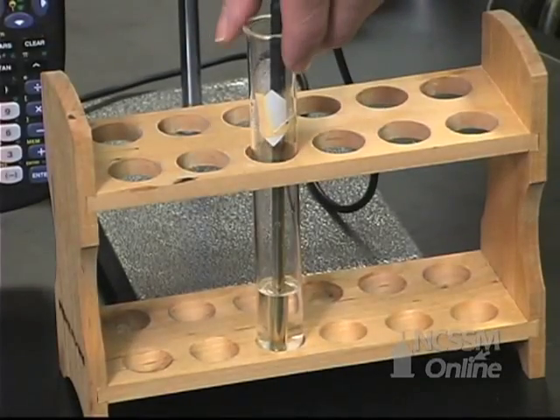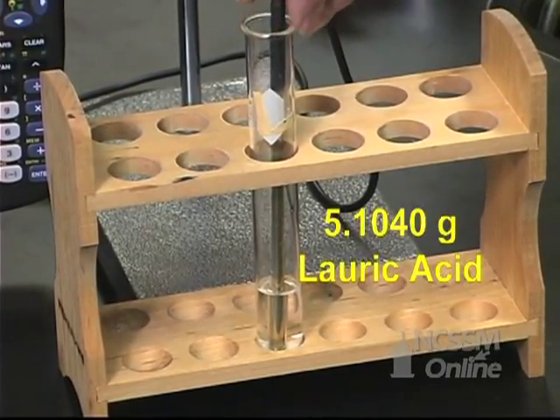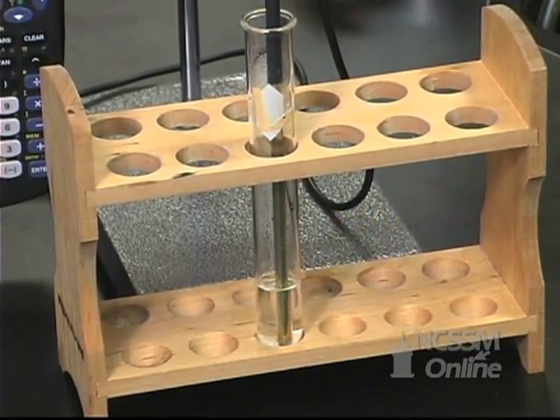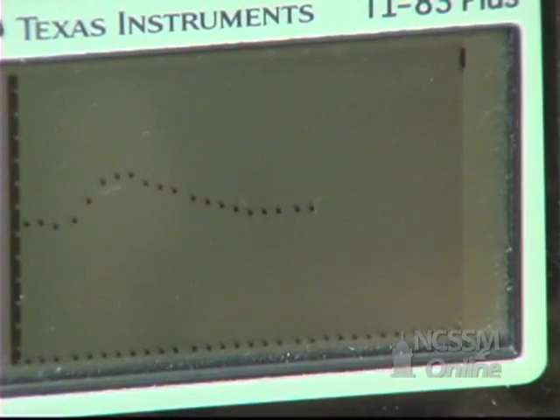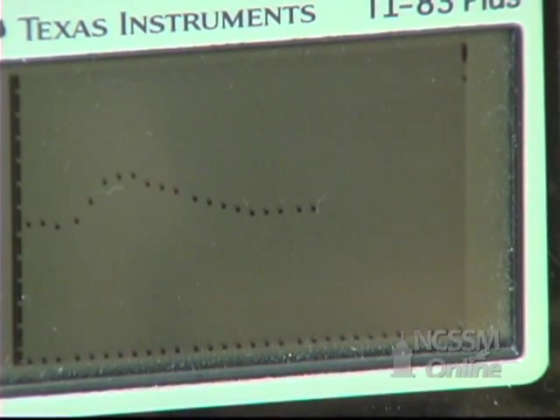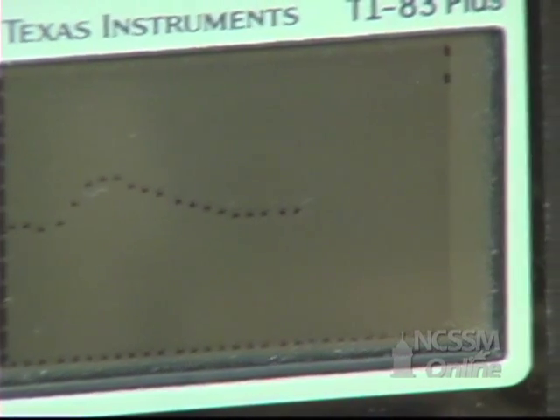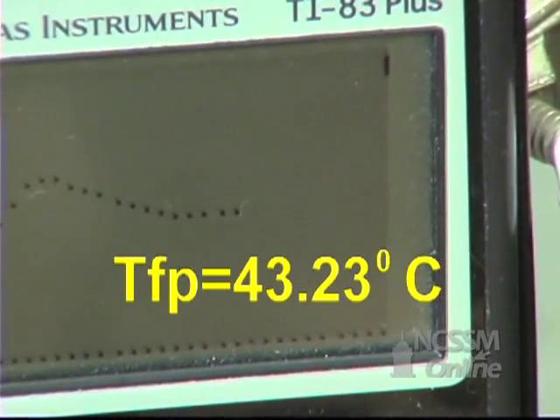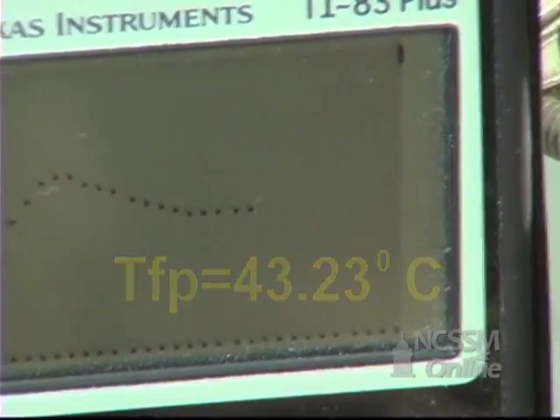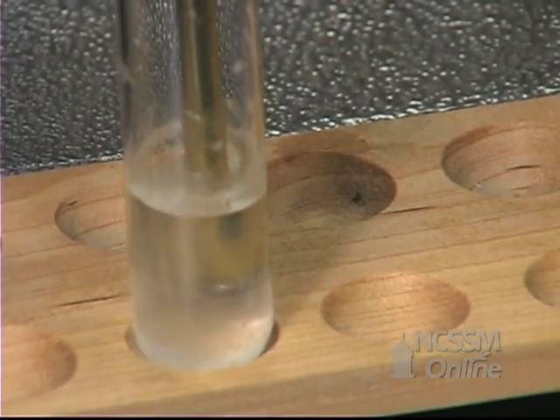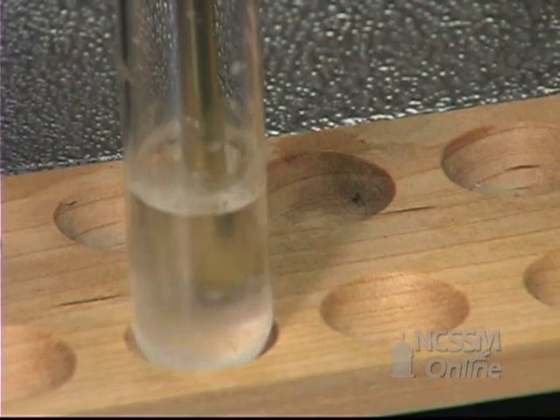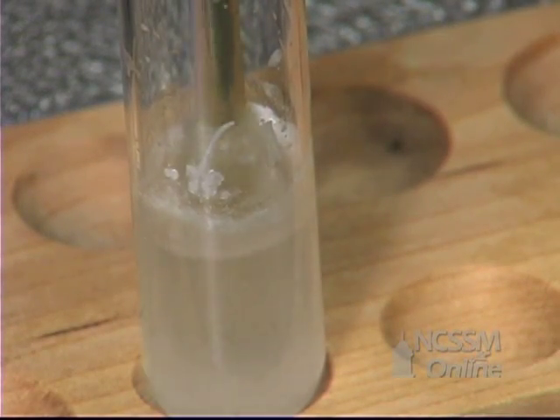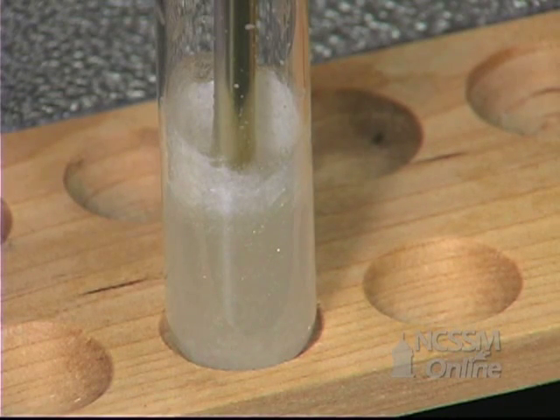We've melted a sample of lauric acid in a test tube and put our temperature probe in the lauric acid. We're now going to start graphing the temperature versus time on our calculator. We're going to monitor the temperature as the compound solidifies to get the freezing point of the lauric acid. The temperature will drop and then level off as the compound solidifies. We can see crystals start to form.